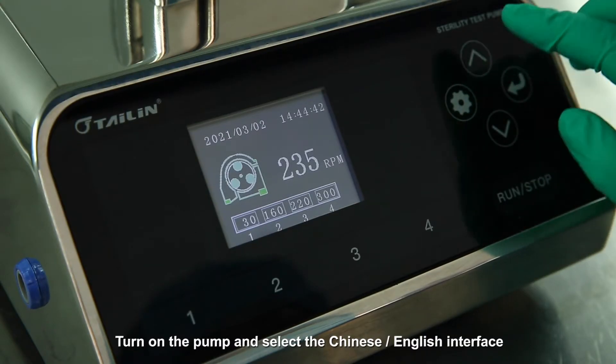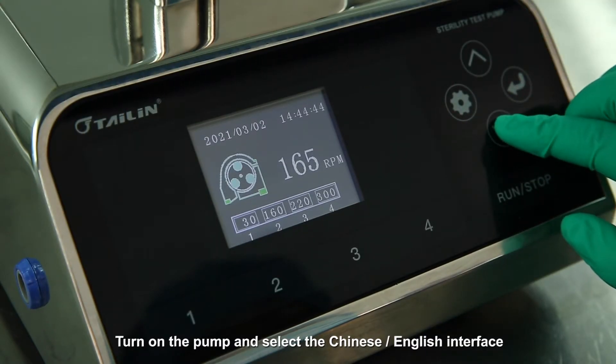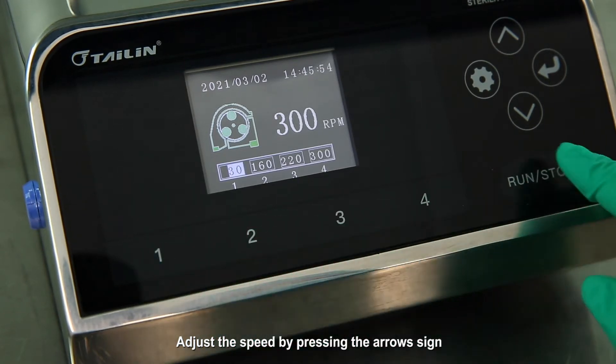Turn on the pump and select the Chinese or English interface. Adjust the speed by pressing the arrow sign.